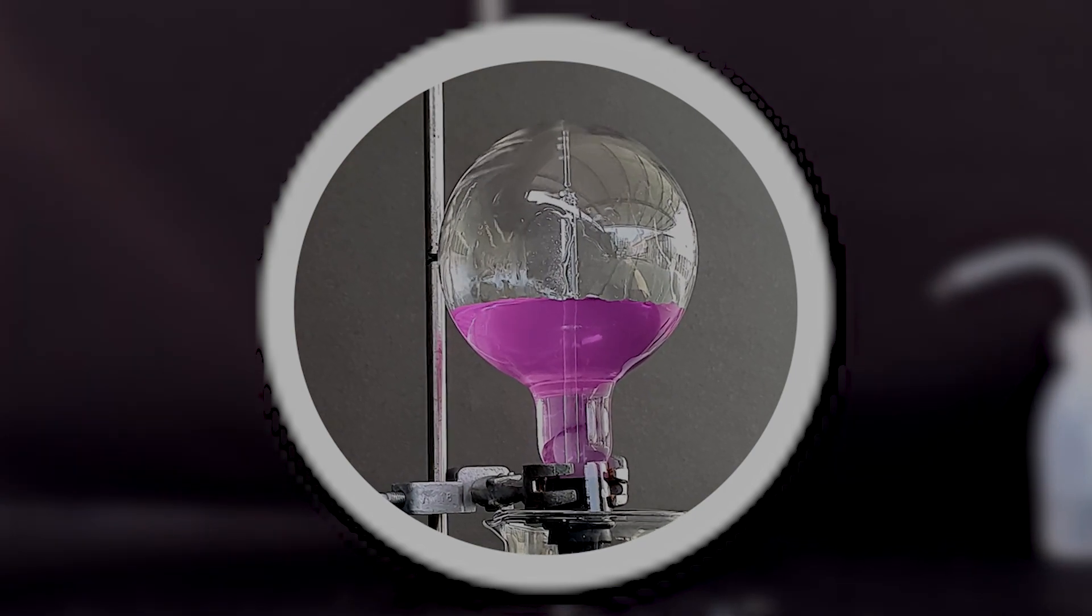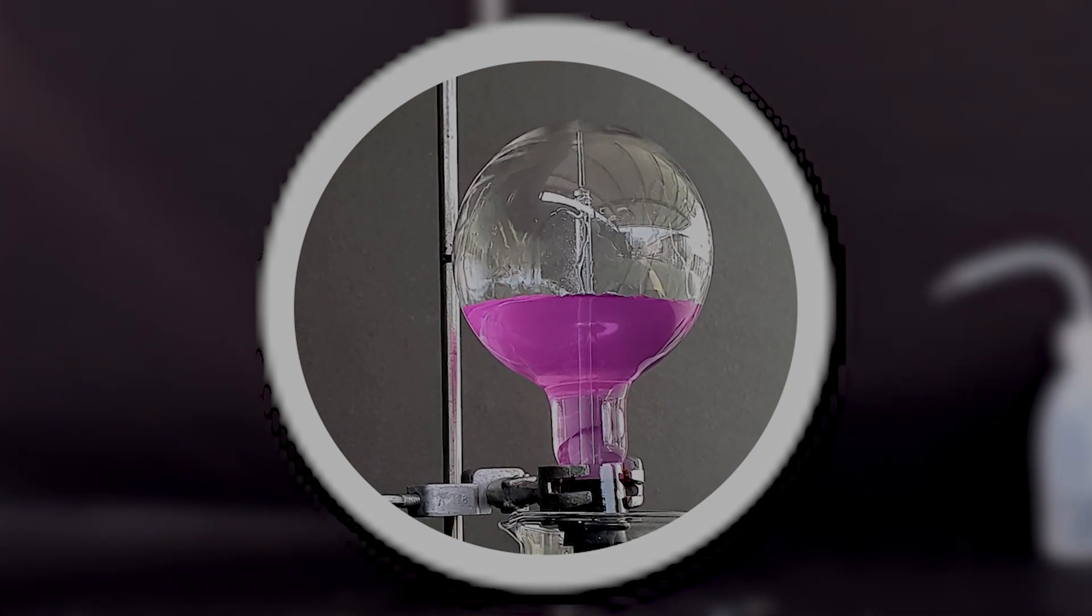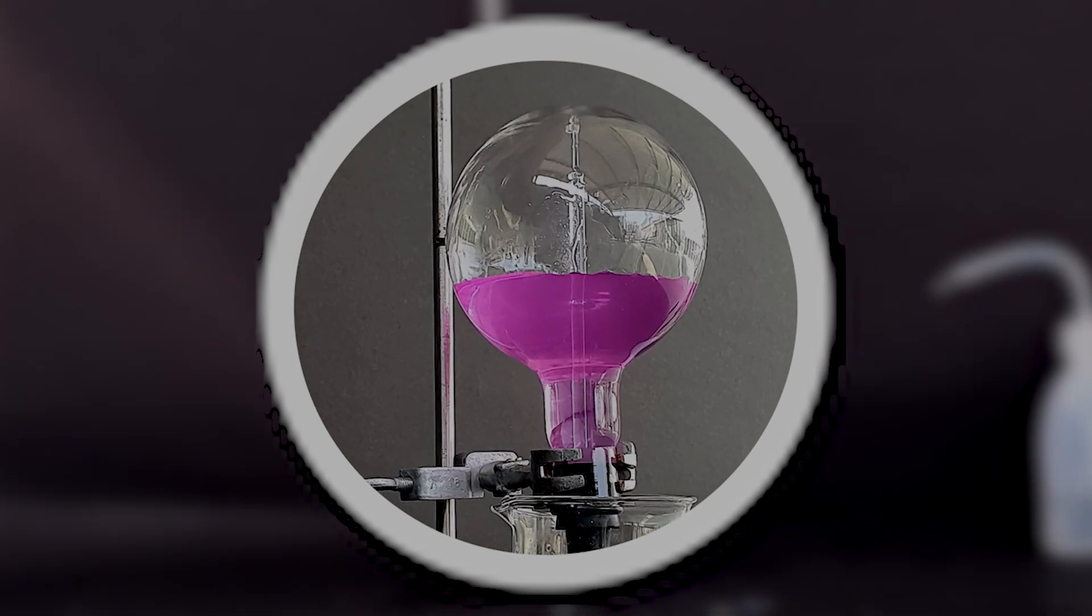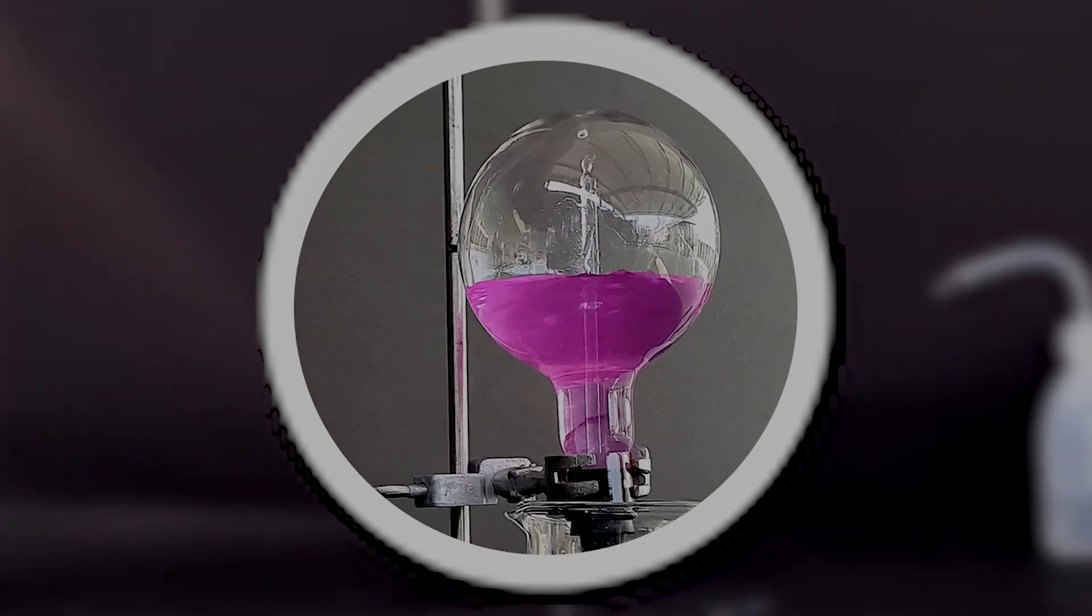Firstly, we would have to understand the pink color produced by the fountain. This is due to the presence of phenolphthalein, which turns pink in the presence of weak bases.